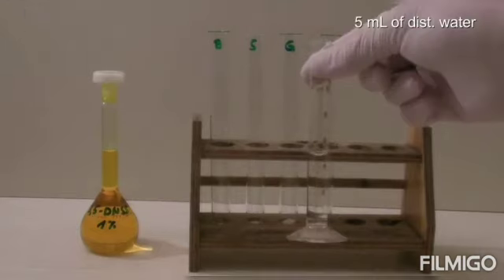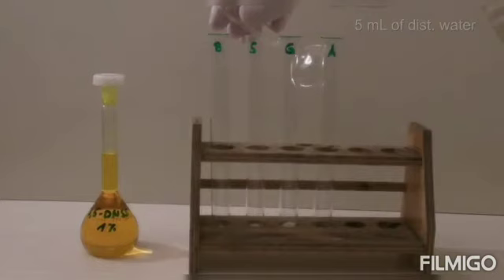Then into each test tube we have to add 5 ml of distilled water, into the blank test tube, then the second test tube and the third test tube containing glucose.